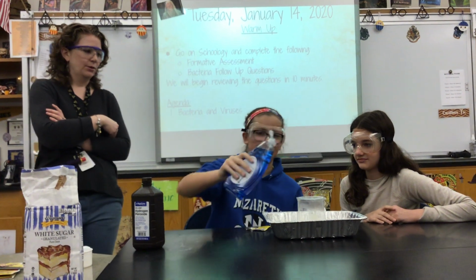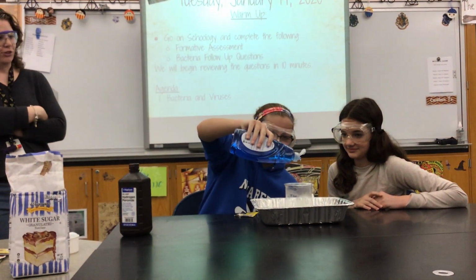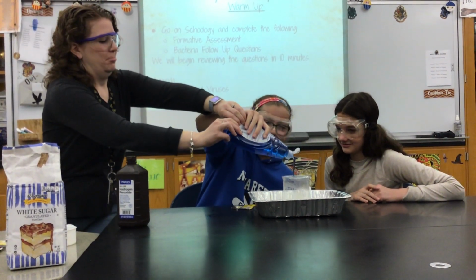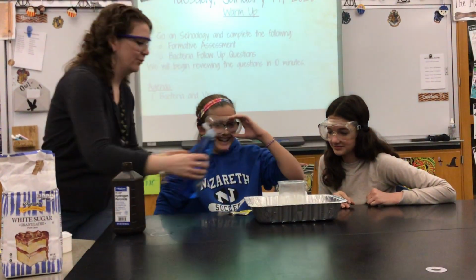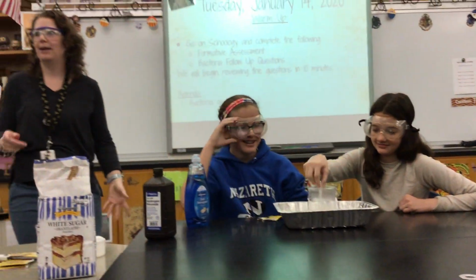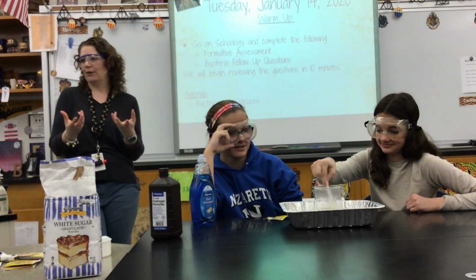Okay? Like how little? I'll tell you when to stop. Okay? Why are we adding the dish detergent? Oh! A mess. There we go. Stir it up again. Why are we adding in the dish detergent? So it makes it bubbly. Yes. That's just so we can see the reaction better, right?